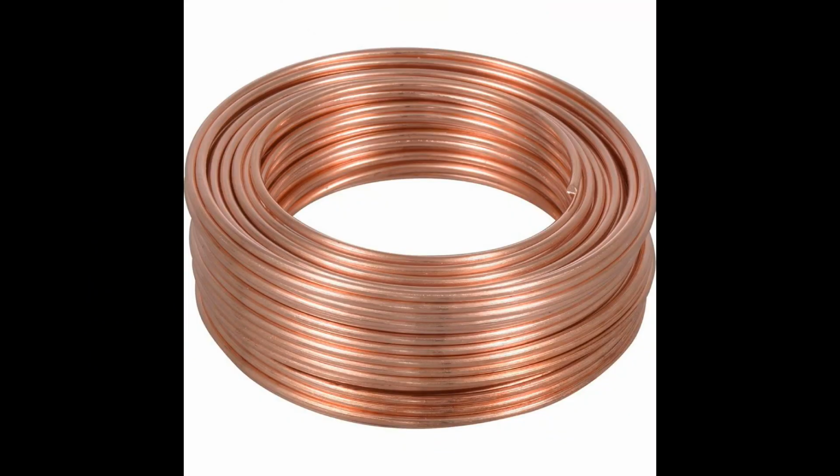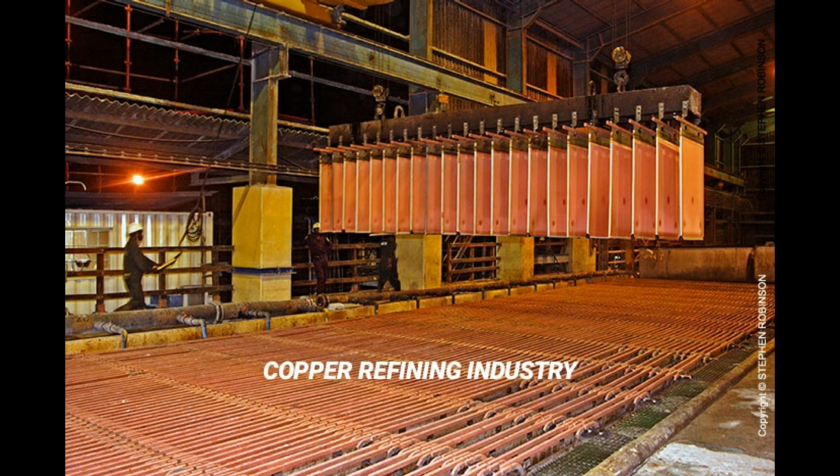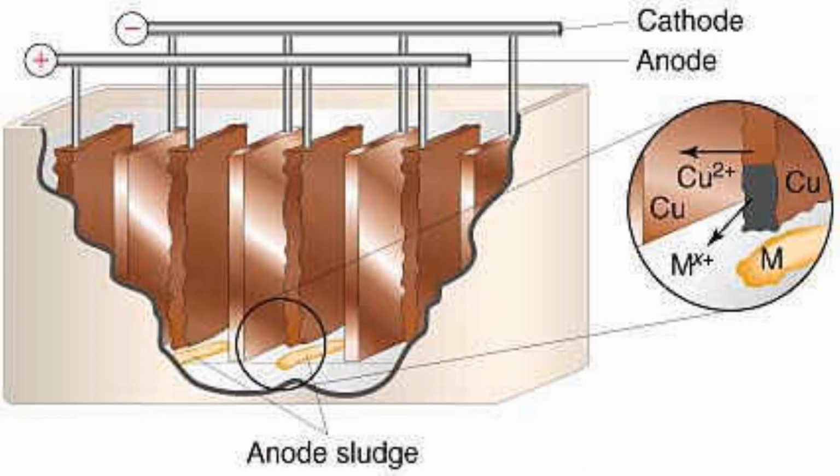Crude copper is not suitable for use in electrical applications because its impurities reduce the metal's conductivity. This video is all about the electrolysis of aqueous copper sulfate using copper electrodes. This method is mainly used in the copper refining industry.